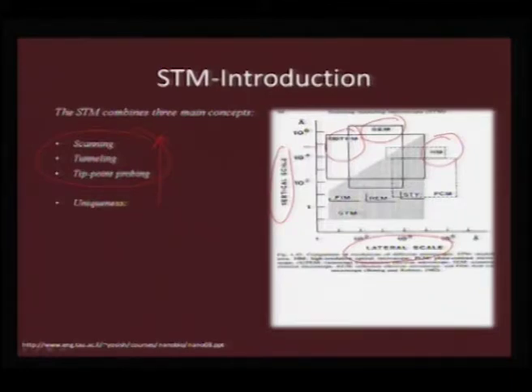Therefore, we have so far been more interested in, or adapted more to, materials characterization along this domain. So, SEM, TEM, optical microscopy have helped us, but more so in recent years the shaded area has become a point of focus.